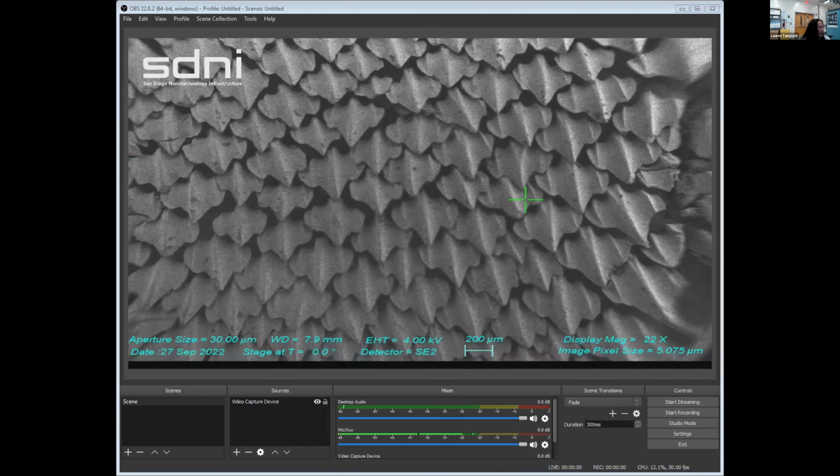I can't really see the chat, but if anyone guessed shark scales, then they're right. Yes, there was dragon scales, reptile skin. Oh yeah, you guys are spot on. Same general concept. If you ever talk to any people that work at an aquarium or marine biologists, they probably call shark scales dermal denticles because that's the scientific name for them. But as you can see, their shape resembles teeth rather than scales, which is kind of scary.